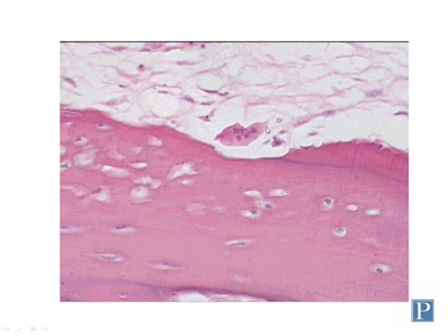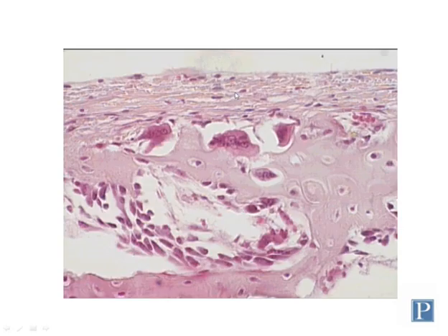Because these destroy bone, they are commonly found near these surface depressions in the bone. These surface depressions are called Howship's lacunae. And this is one of the best places to try to find osteoclasts. Osteoclasts are far less common than are osteoblasts and osteocytes. You should have no problem finding those two, but there are not nearly as many osteoclasts. You really have to hunt around the slide to find them. If you can find these Howship's lacunae, or these depressions, you may often see osteoclasts nearby, although not always. So that's a good place to start looking.